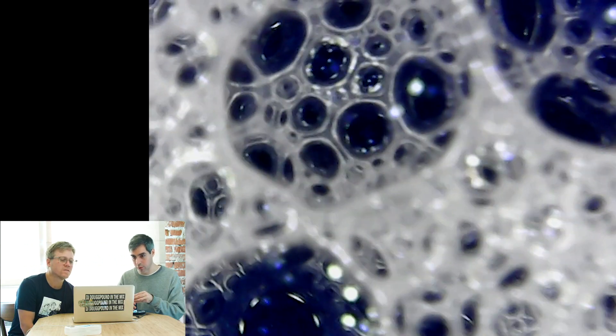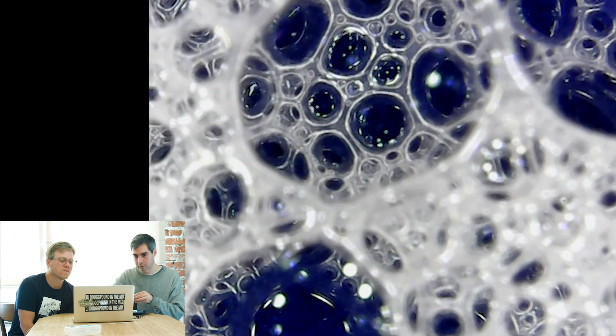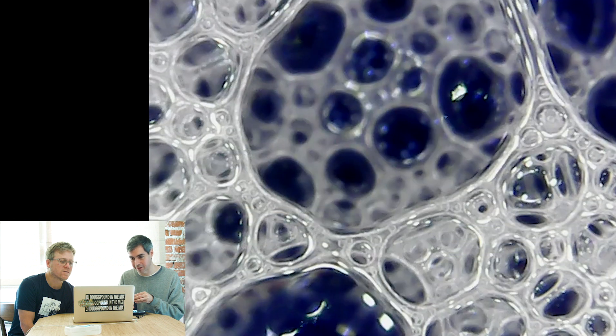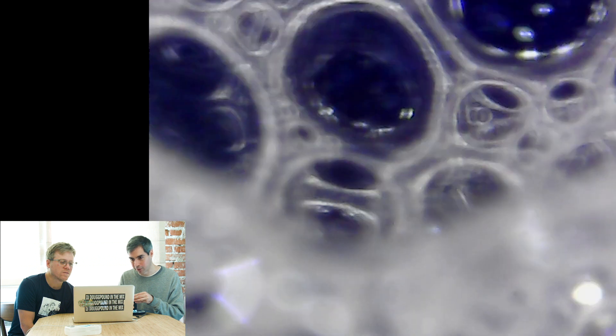Okay, let's see. Oh yeah, when they pop it might look cool too. Okay, this is cool. I knew this was going to be cool. That is neat. I think that's neat actually. Wow. Look at that world. What a world.